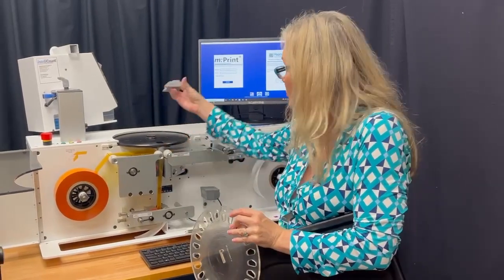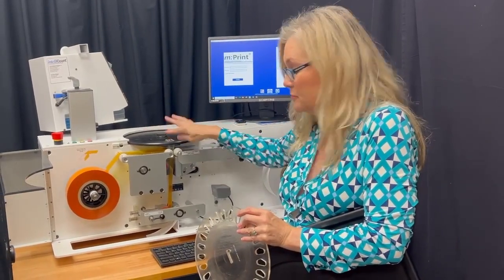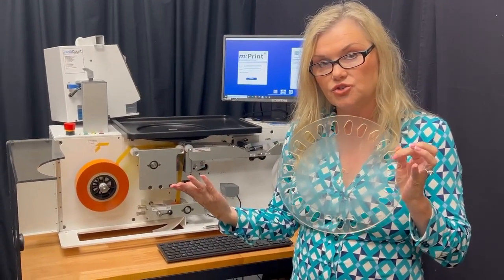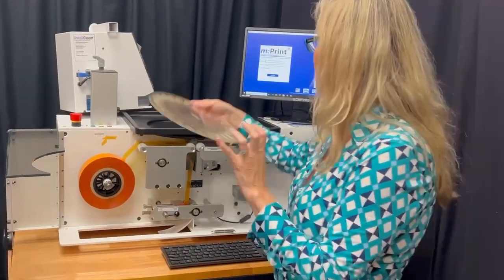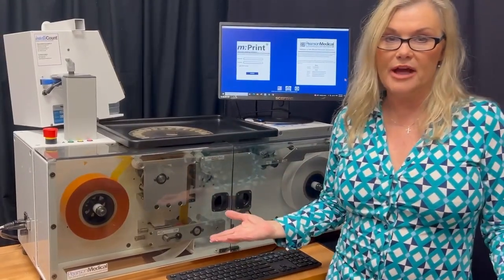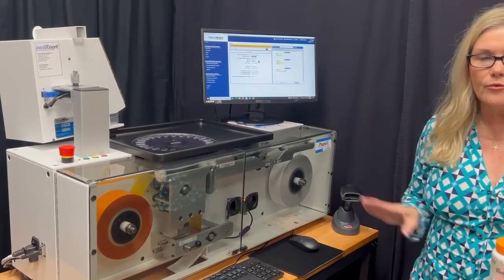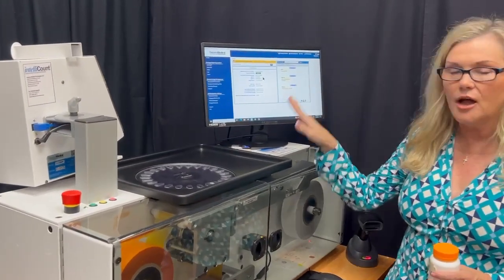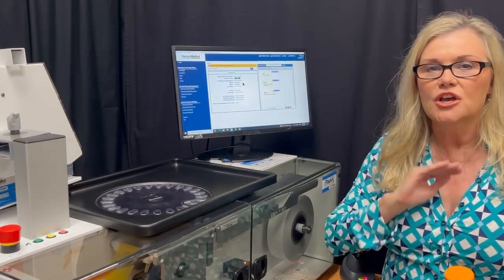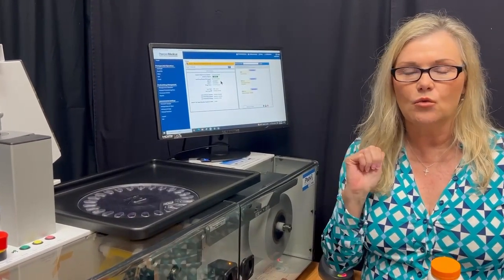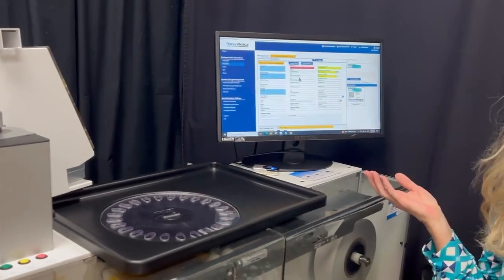Once you have removed and cleaned the parts, you can easily and quickly replace them to start your next packaging run in a matter of seconds. You would start by putting your feed throat, then your pill disc, and then if you're going to package manually — because you have a hazardous drug to package — you're ready. I want to show you a quick short run of how the IPAC RX can easily package drugs: just scan it, and it's a one-click print.